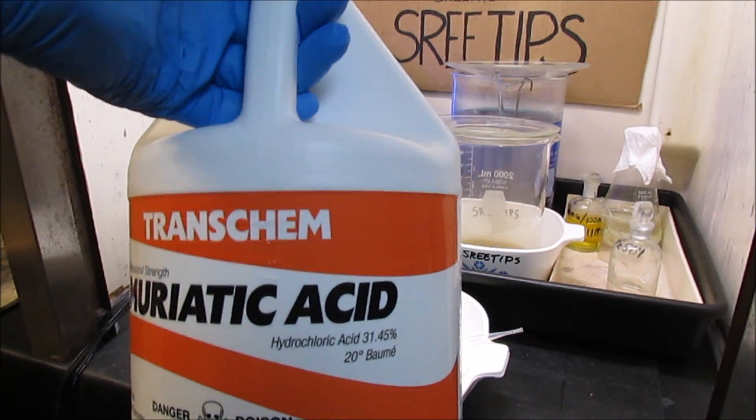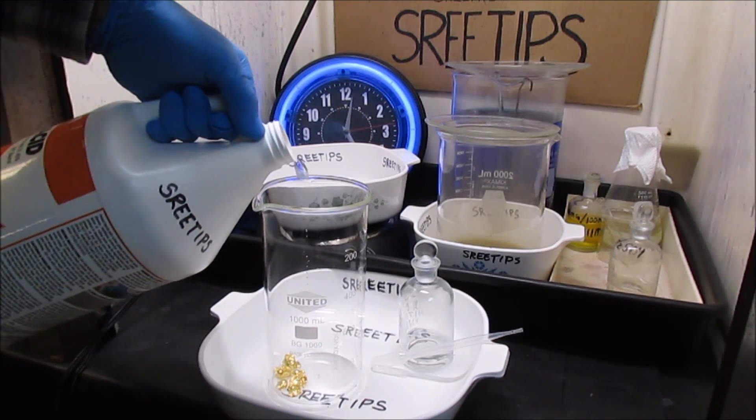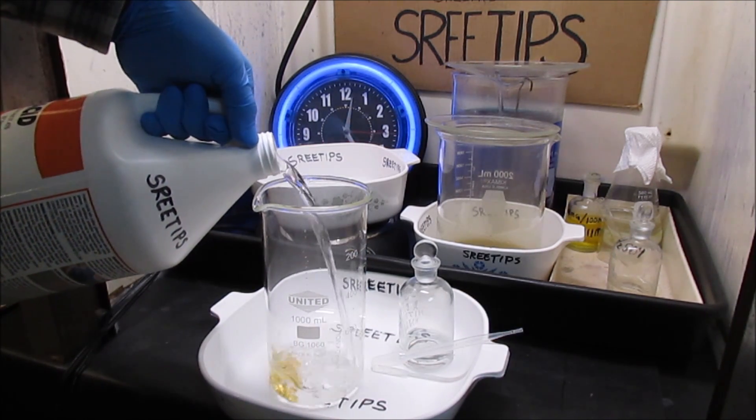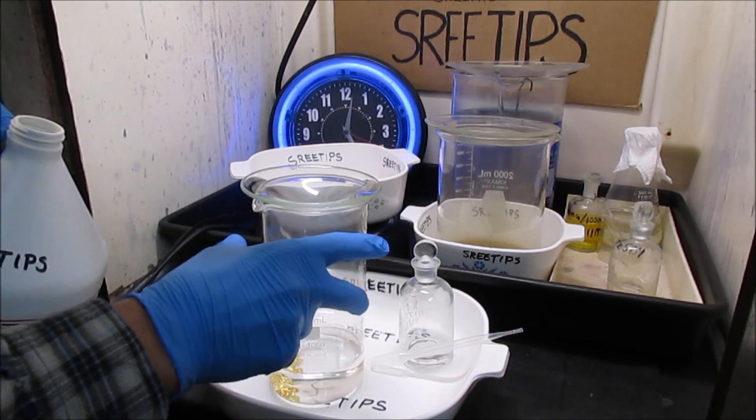Now I'm going to add some hydrochloric acid here, about 200ml, and I'll put a cover on it and put it on the heat.